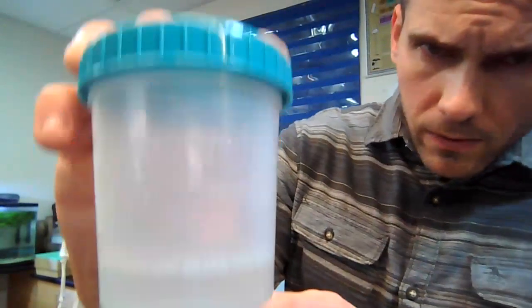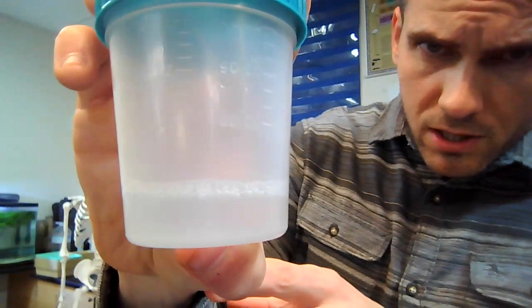now you're going to add 20 milliliters. You guys will have these little cups, and there's a little metric on there. You'll see the bottom line with a number is 30 milliliters, but there are 2 lines underneath that. So you can do the math. If it takes 3 lines to get up to 30 milliliters, which line would the 20 be on? You can figure that out. All right, but you should have 20 milliliters of what's called extraction buffer.